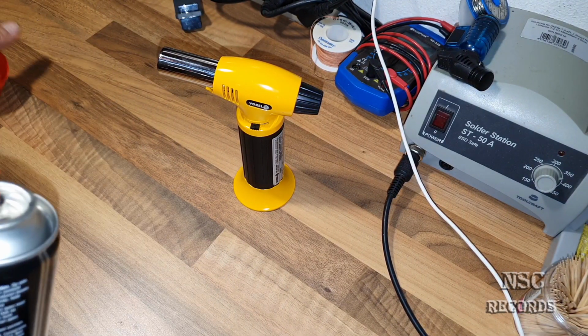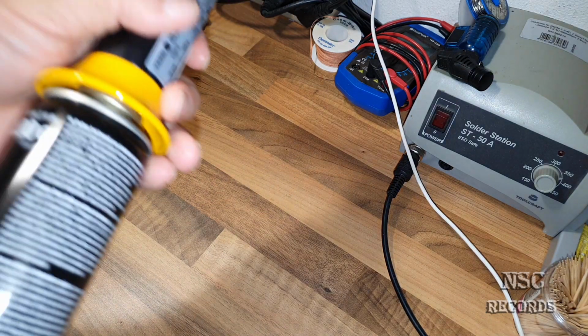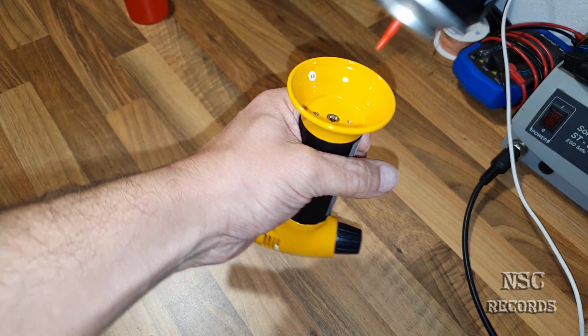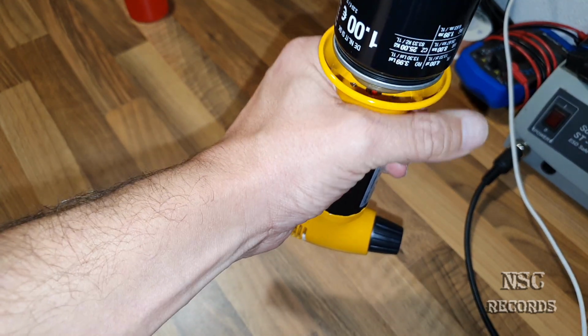So let's now get some gas inside. I hope I got the right one. Let's test it. And also, if you try to get some gas inside, always do it like that, okay? Just turn it like that to the other side. Uh-huh, it works.